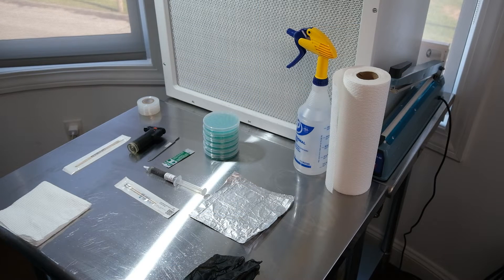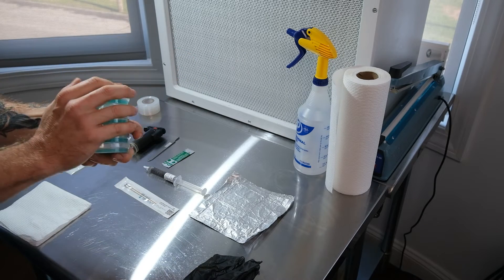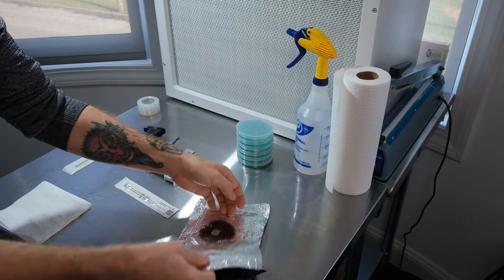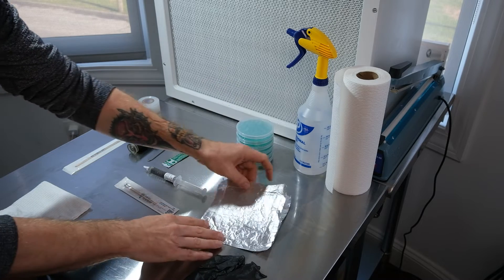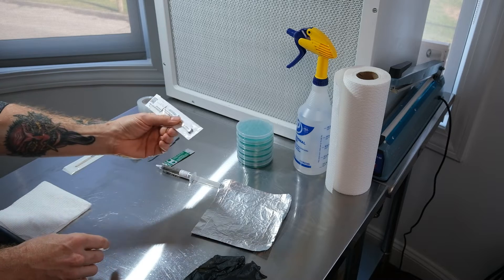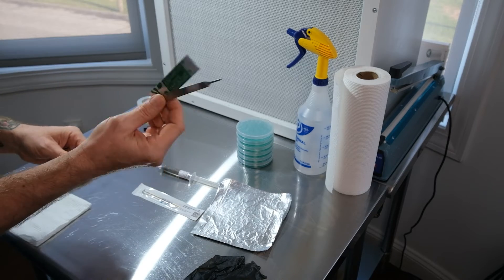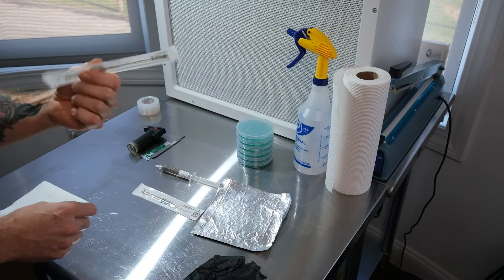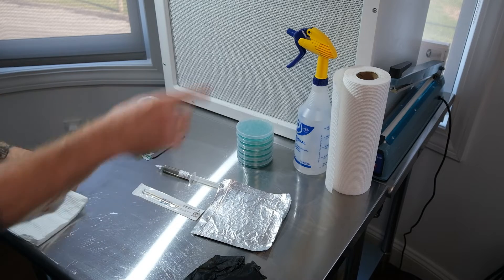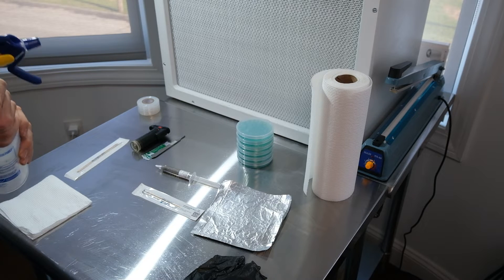Let's go over the things you'll need. First, agar dishes — I use potato dextrose agar, which is just water reserved from boiled potatoes and agar. You obviously need your spores. Here we have a spore print, a spore syringe with spores floating around in it, and a spore swab. I'll be using a scalpel — you can get those on Amazon. You'll also want a clean swab and a small hot flame to sterilize your blade.